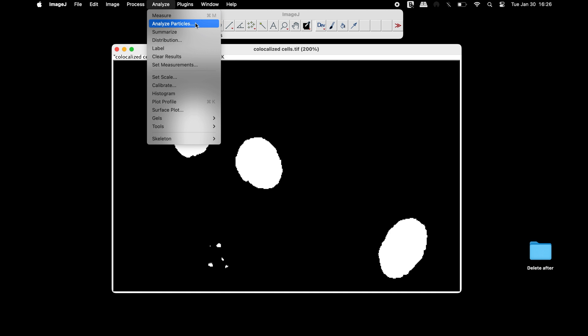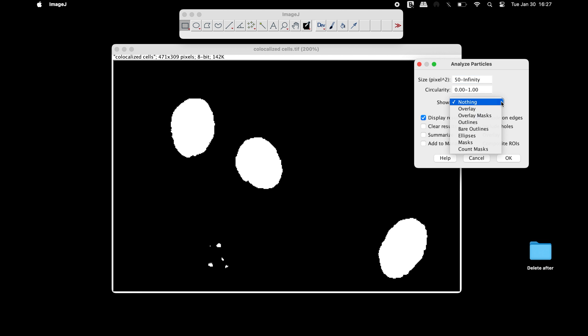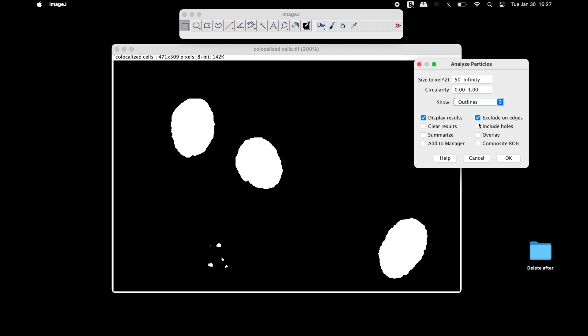To count the number of cells, click on Analyze and then Analyze Particles. In the Analyze Particles window, set the particle size such that undesirable cells can be excluded. In the circularity and show options, users can set the parameters of their choice.